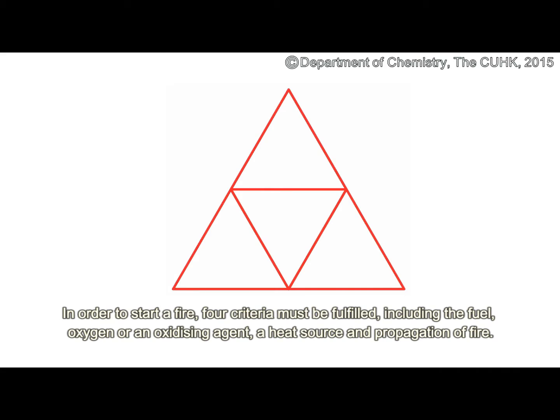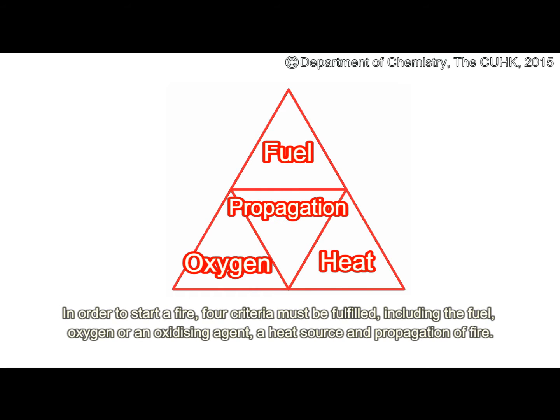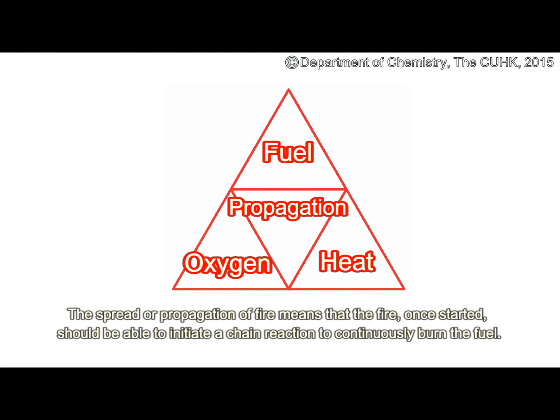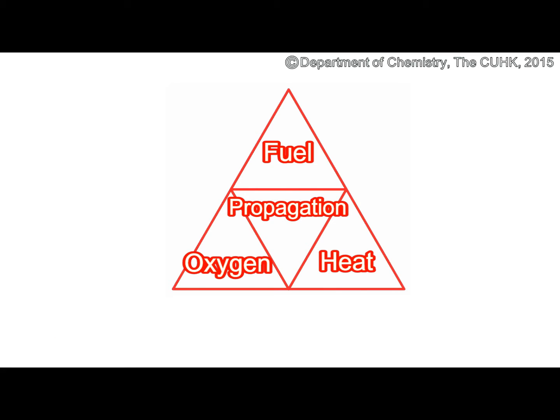In order to start a fire, four criteria must be fulfilled: the fuel, oxygen or an oxidizing agent, a heat source, and propagation of fire. The spread or propagation of fire means that the fire, once started, should be able to initiate a chain reaction to continuously burn the fuel. This is illustrated as the fire tetrahedron.